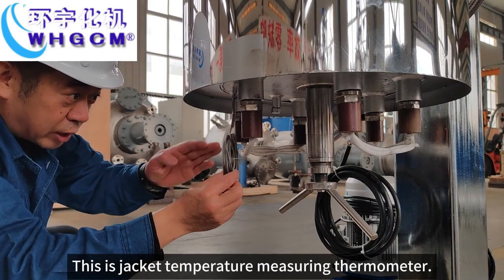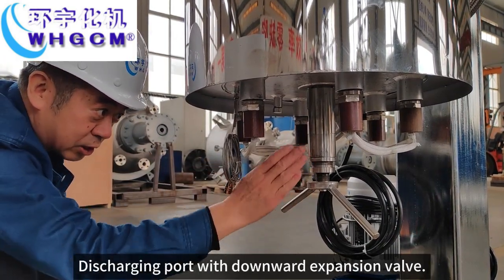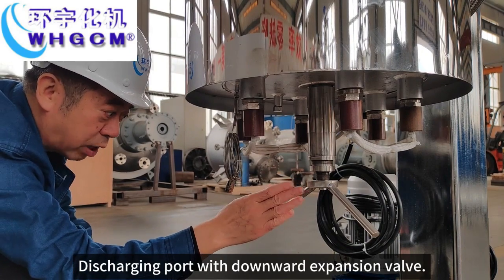This is the jacketed temperature measuring thermometer. Discharging port with downward expansion valve.